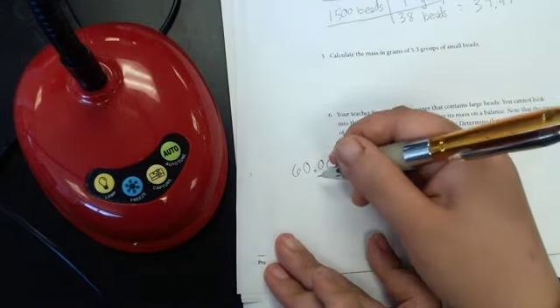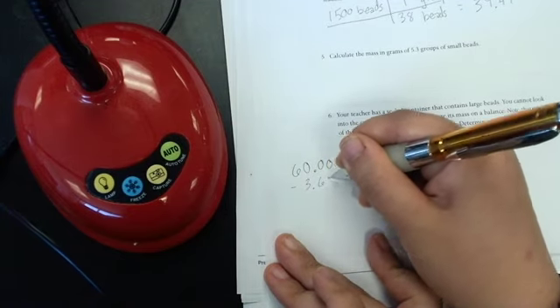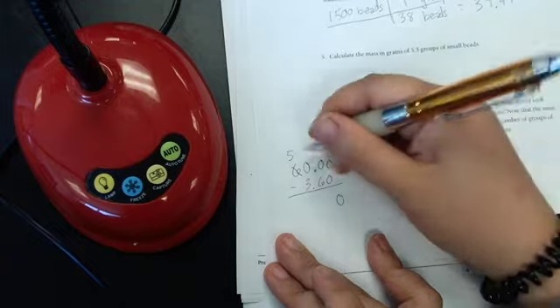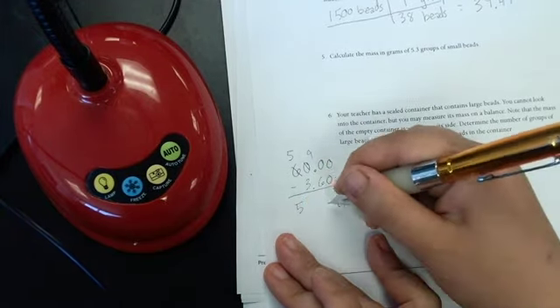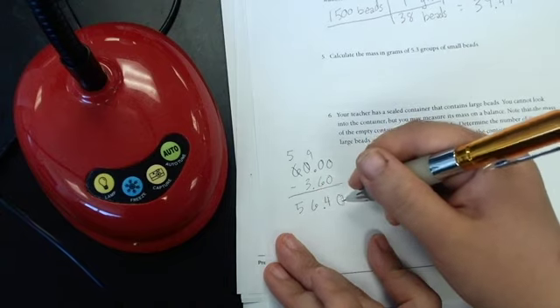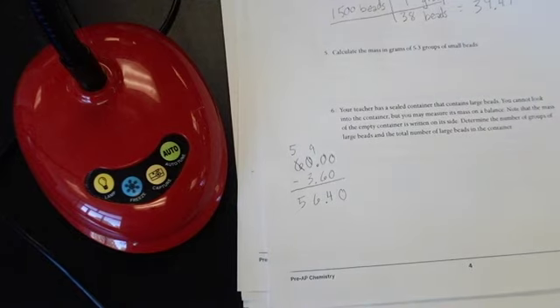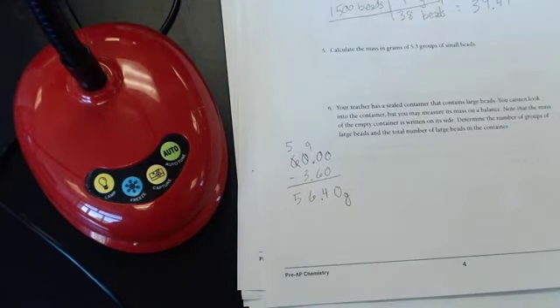So 60.00 minus 3.60 is going to be 56.40. Let me double check my answer because sometimes I'm not the best at math. Very good. 56.40 grams is in my cup right now.